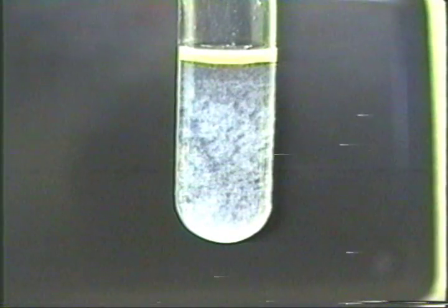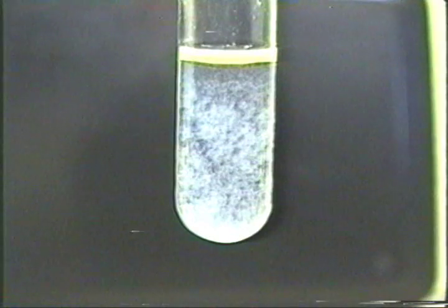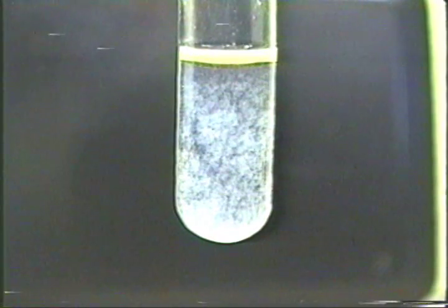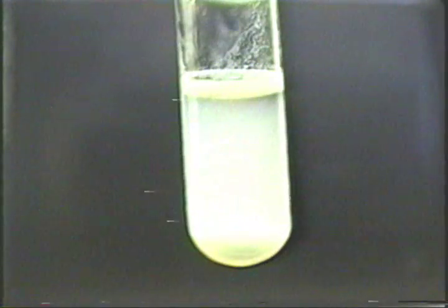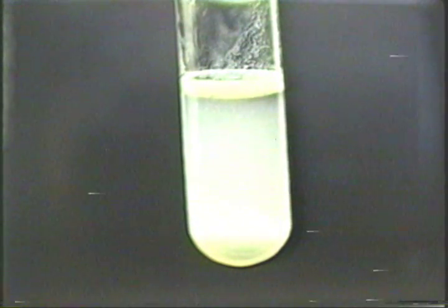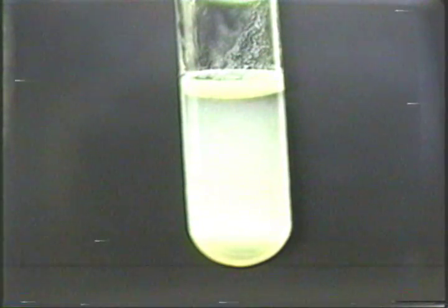Here's a close-up of the magnesium carbonate precipitate, and as you can see at this point it has a feathery-like look, so this would tend to be flocculent. On the other hand, the barium carbonate appears to be more finely divided. In any case, the important thing here though is that a precipitate is or is not formed.